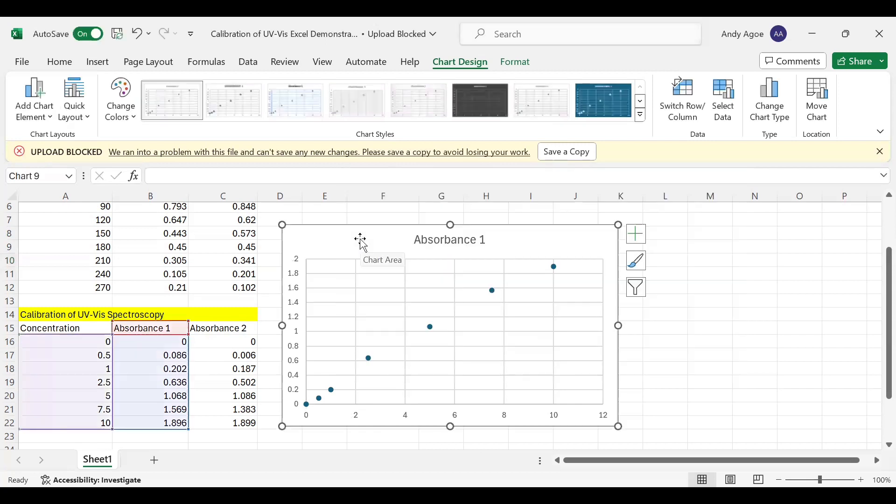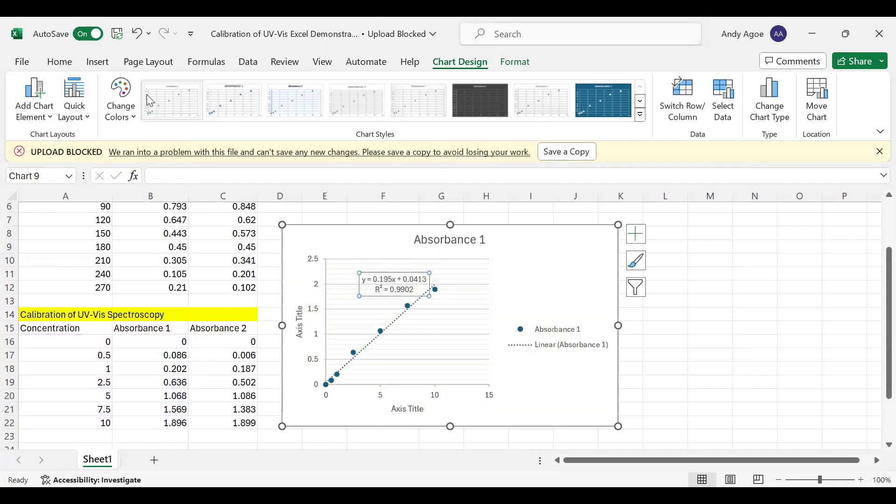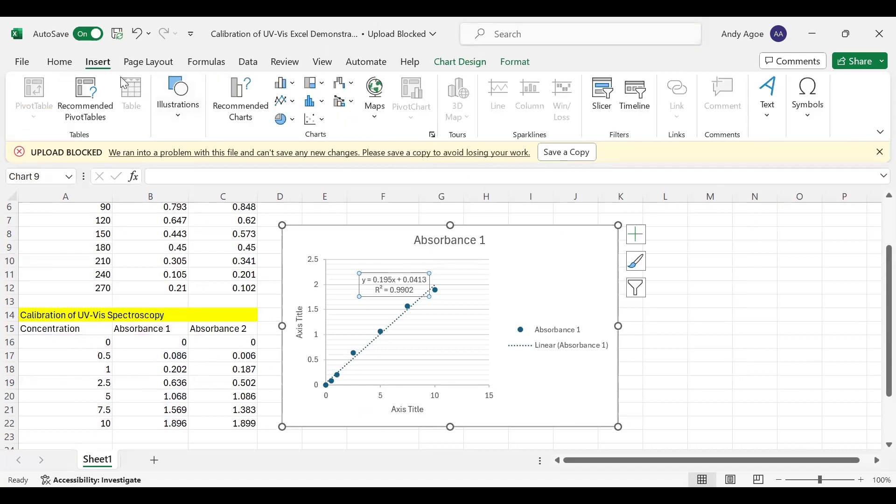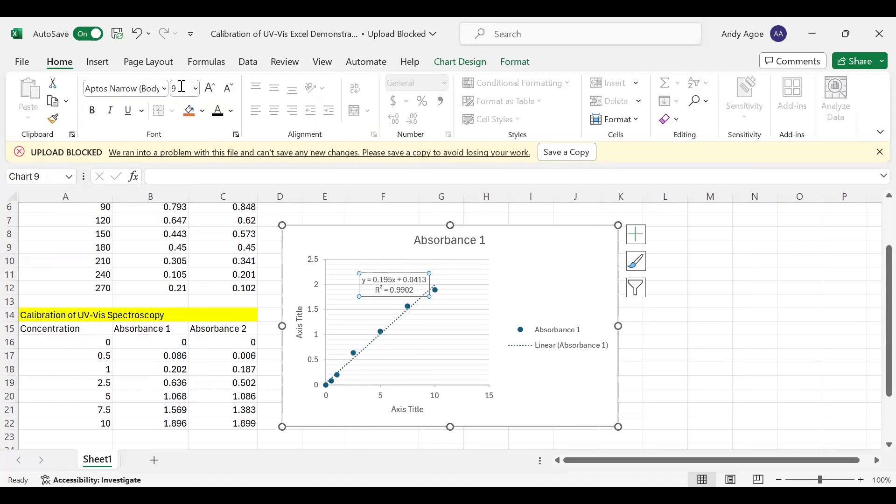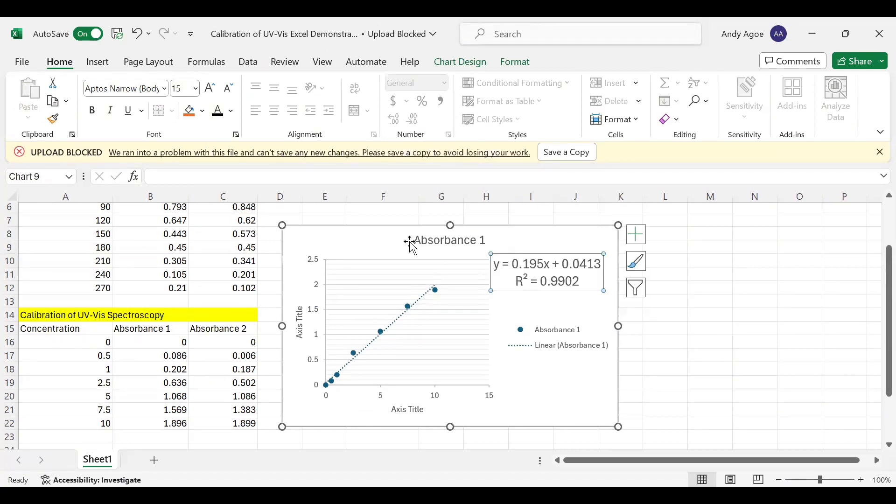Now to quickly display the equation of a line, we can access it by going to the Quick Layout, then we select layout nine. Then we have our equation of a line with our R-squared value. Let me increase the font size to make it more visible.